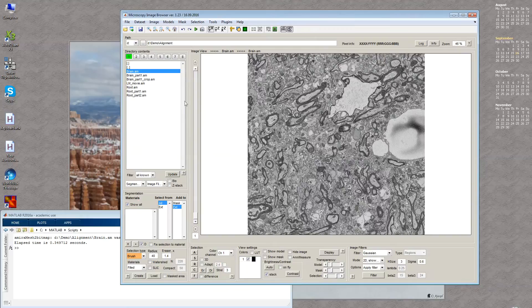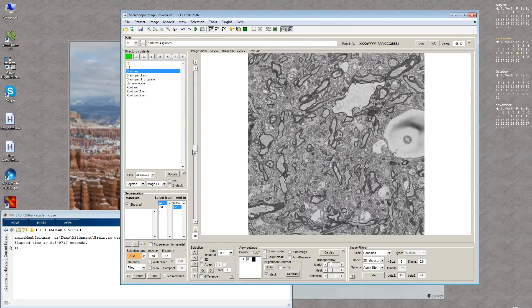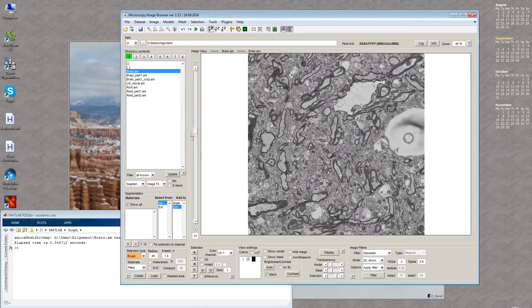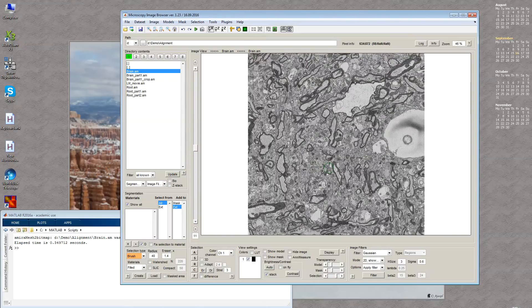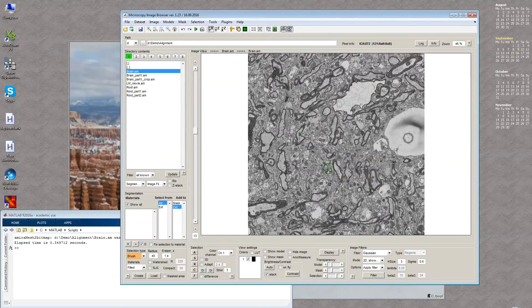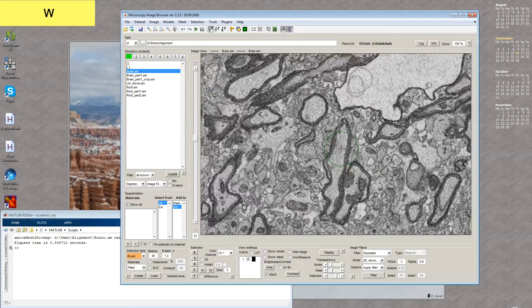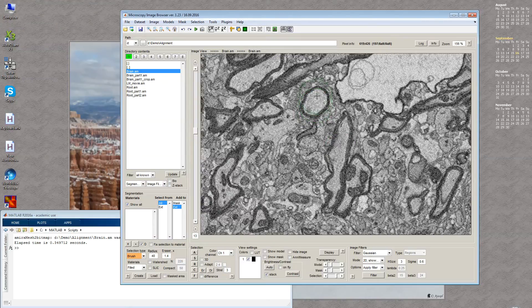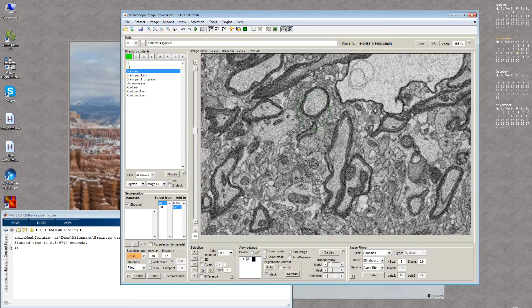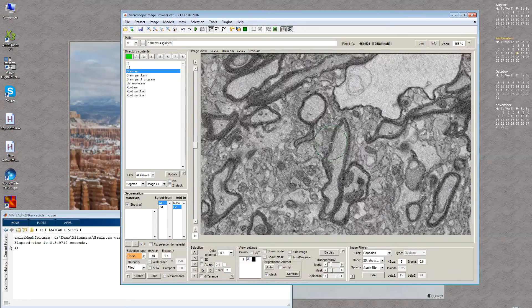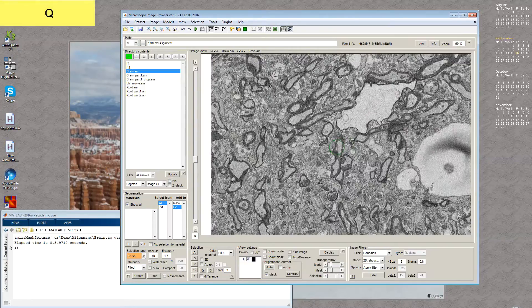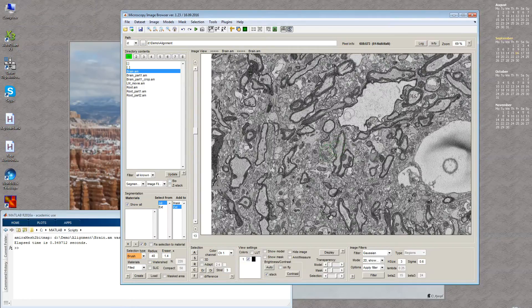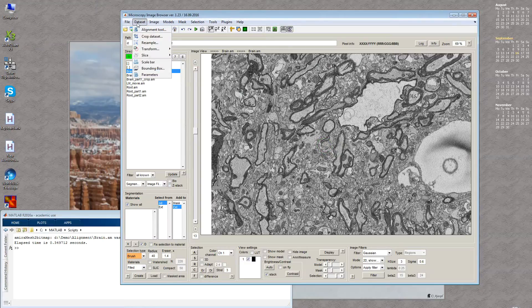First I open the dataset which is brain tissue imaged with serial block face SEM, and you can see that there was some kind of drift between slices. For example, if you compare these two slices you can see there is translation of one slice against the previous one. This can be corrected using the alignment tool which is available in the menu Dataset Alignment Tool.